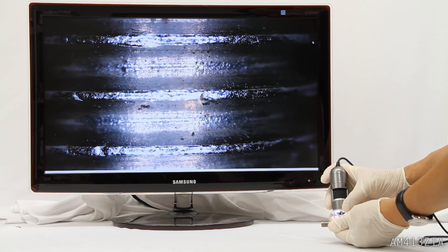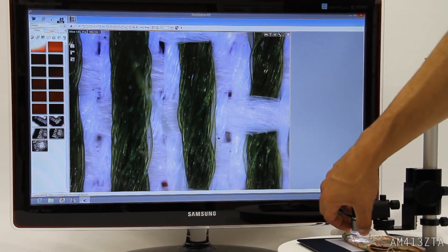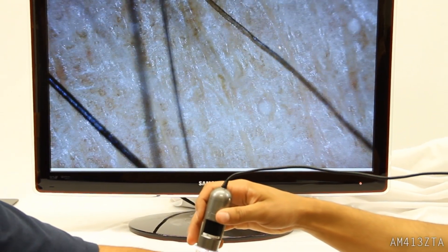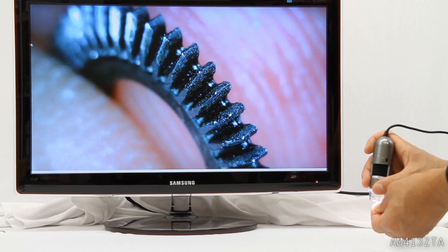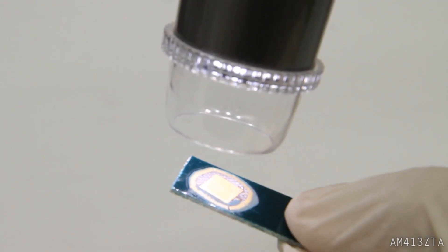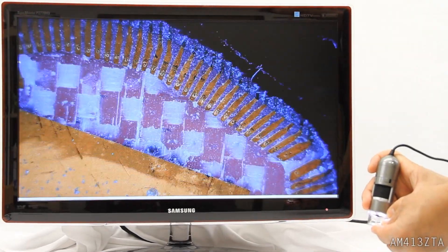This model features a 1.3 megapixel camera that connects directly to a computer via USB 2.0 and runs with the feature-rich included DinoCapture software. The AM413ZTA has a magnification range of 10 to 50 times and another focus point at about 200 times.